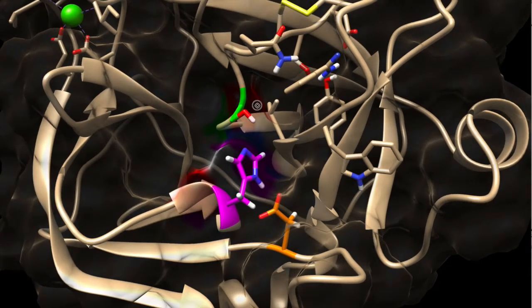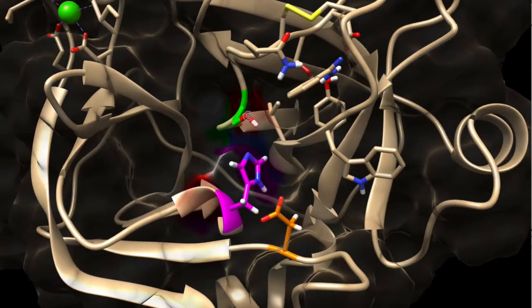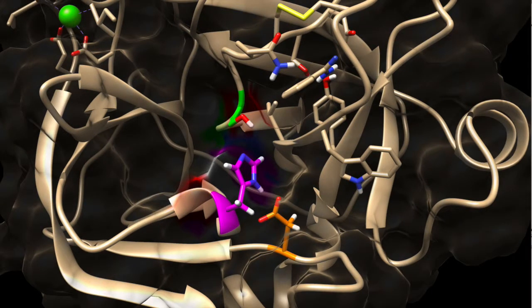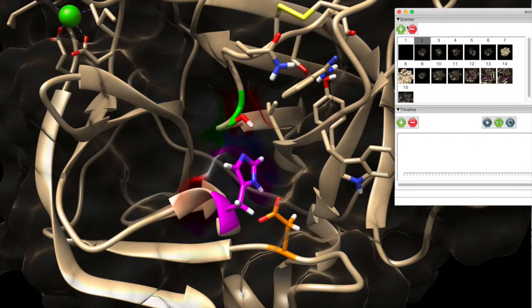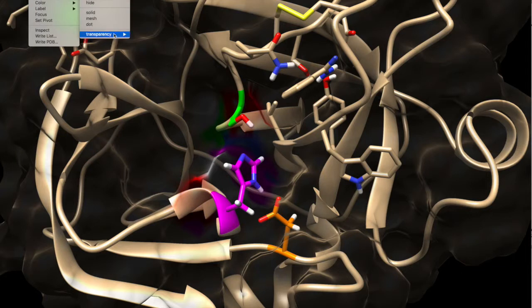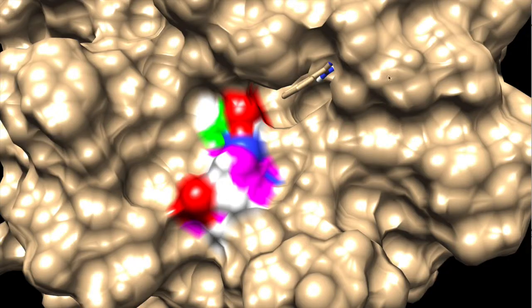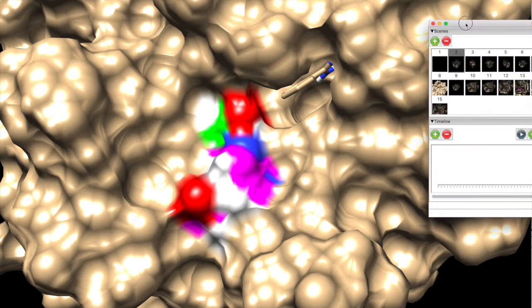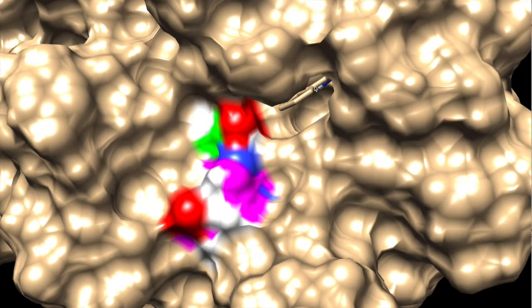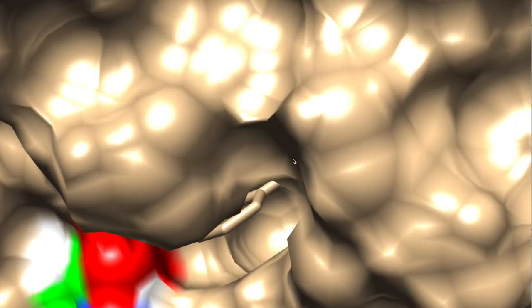So to do that, I would like to show the binding pocket. Okay, so one scene like that. Very good. I would like to make my surface less transparent, so I will stick to 0. I will create another scene and I will zoom it so that I have it centered on the screen.